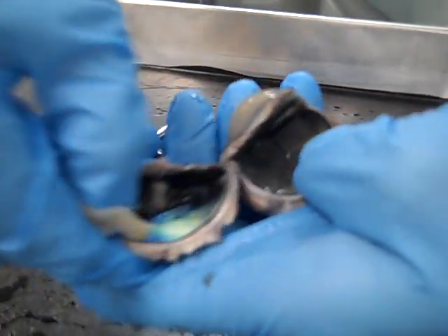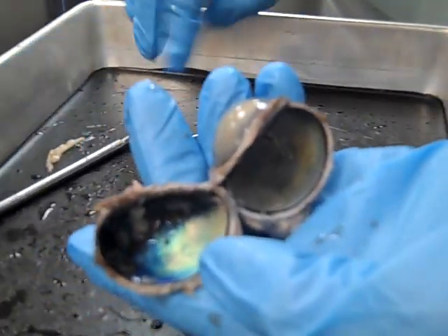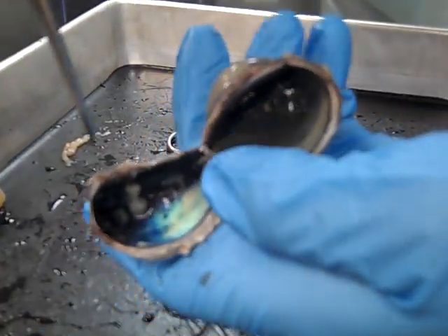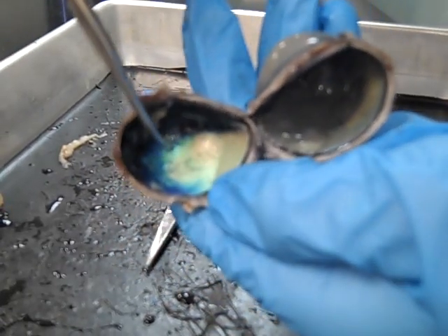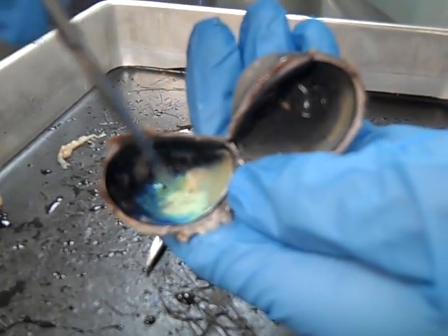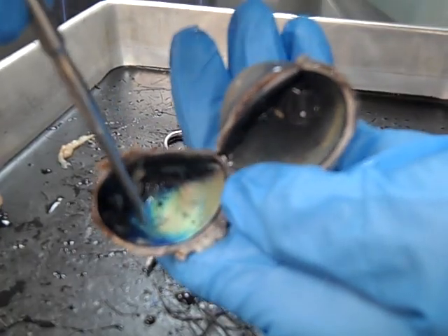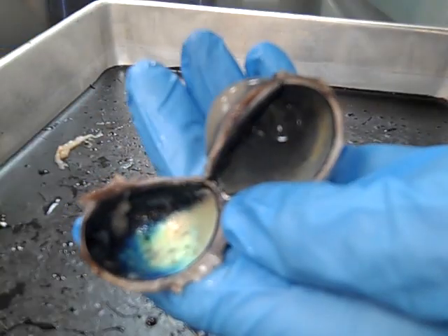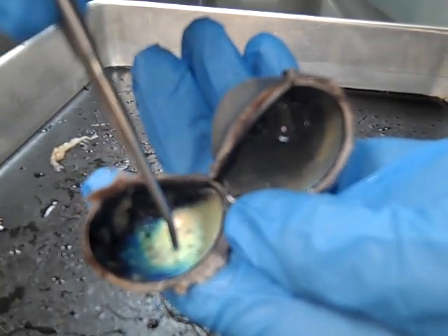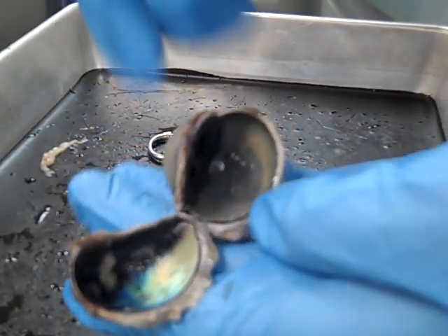We need to get rid of the retina to see the layer underneath, and that is the choroid. In humans the choroid is just black like this. But in many types of animals, including cows, they have an additional reflective element of the choroid called the tapetum lucidum. That allows them to see in low light conditions at night. It's also what causes eye shine in many types of animals, including cows.